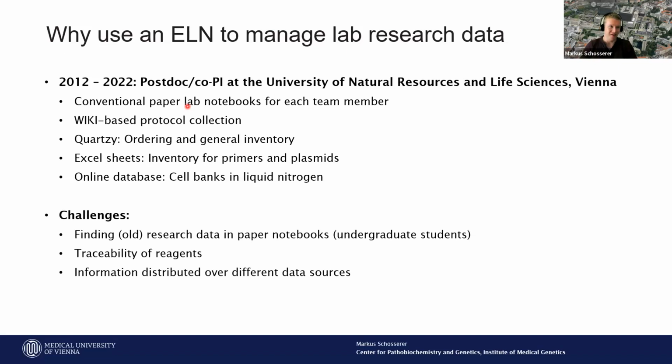And I found this very challenging because for getting some specific information, you had to rely on many different data sources to get all the information together. Another big challenge, especially in the last few years and during the Corona pandemic, was finding all research data in paper notebooks, especially from undergraduate students who left maybe 2 years ago. Finding some specific data in their lab notebooks was very tedious and took a lot of time.